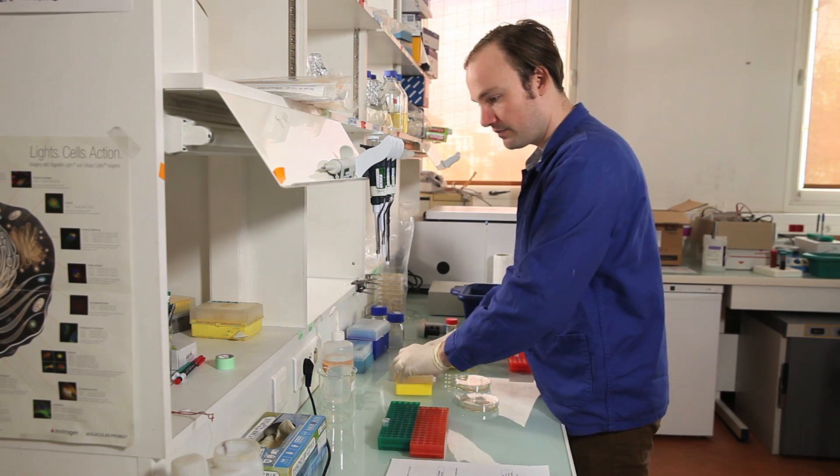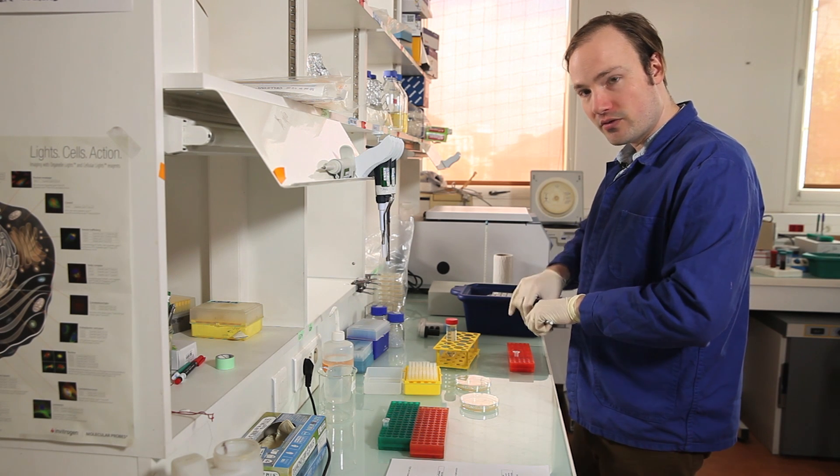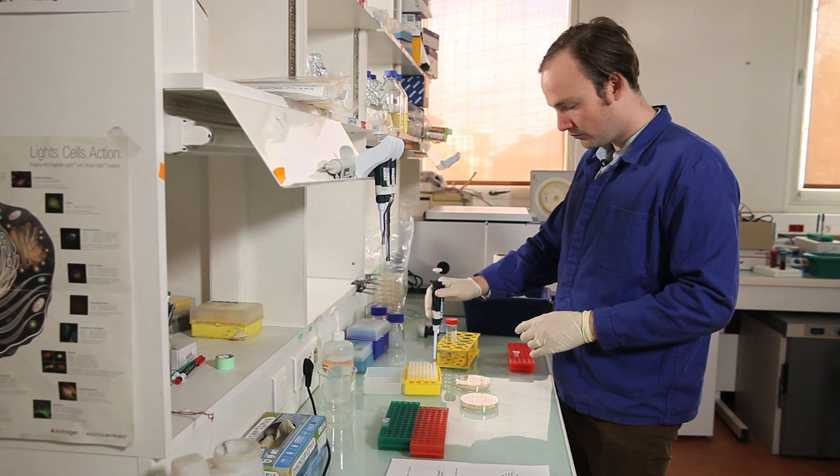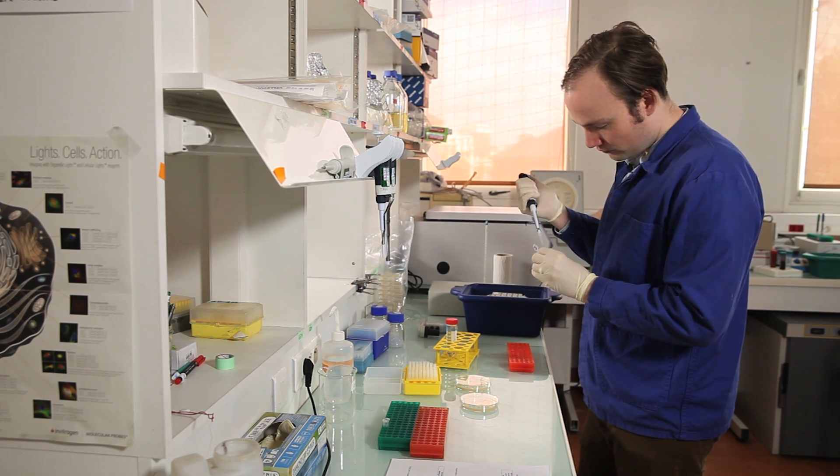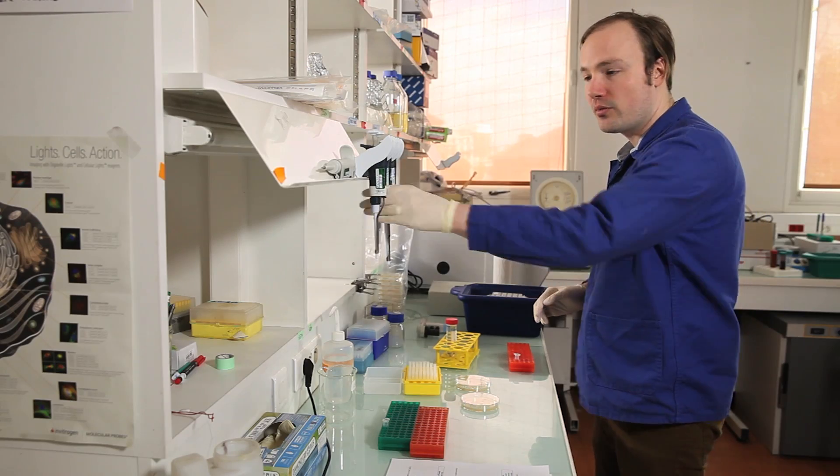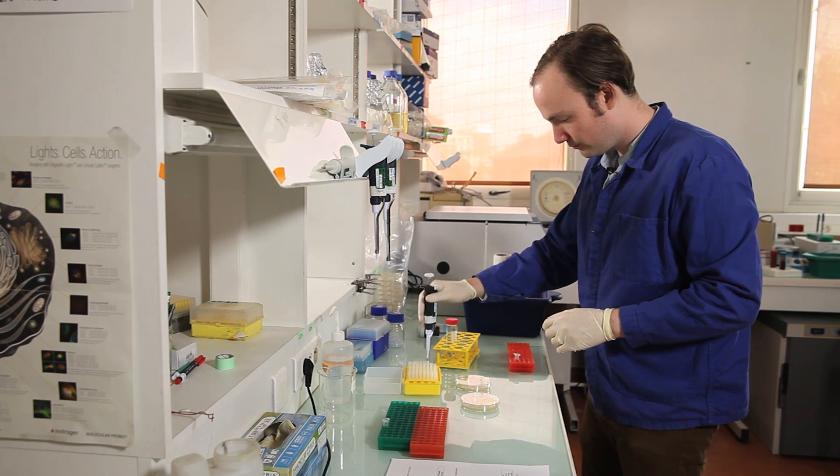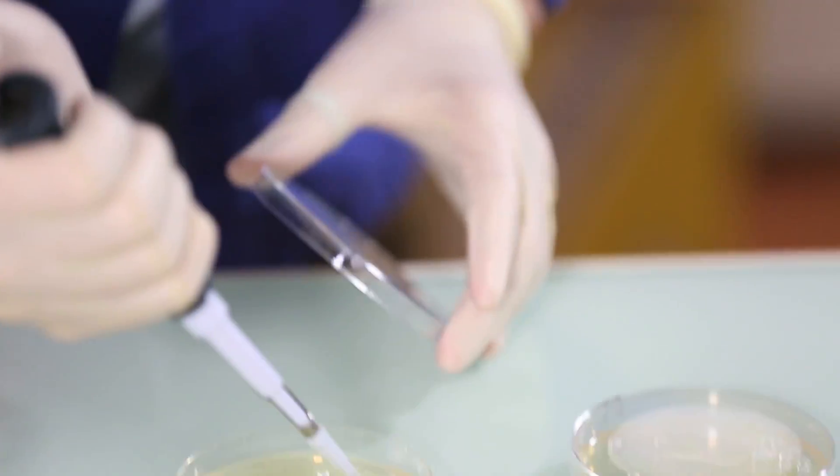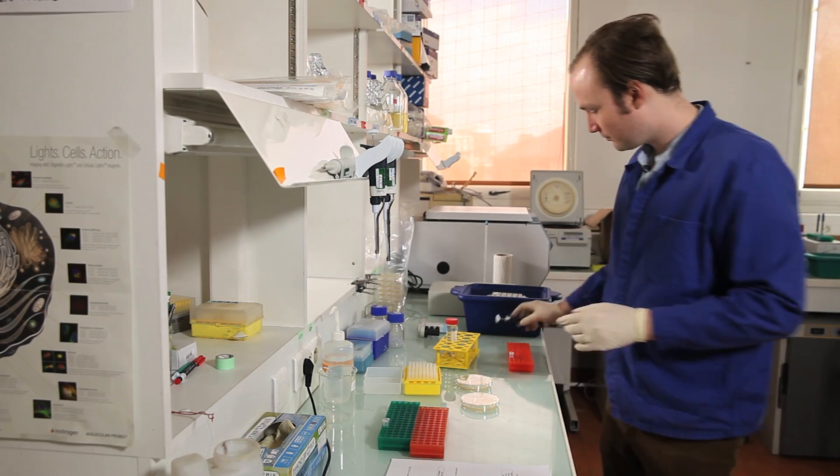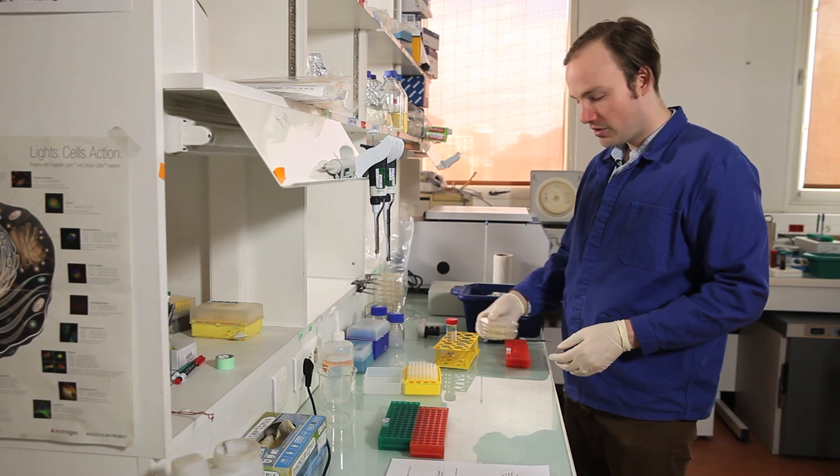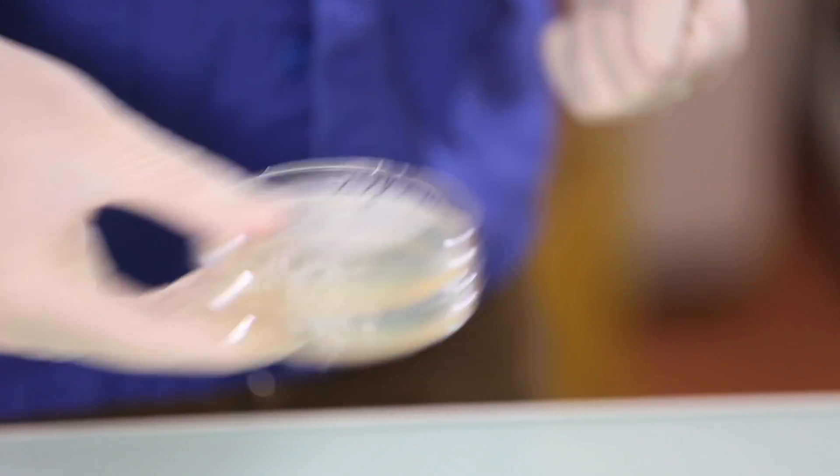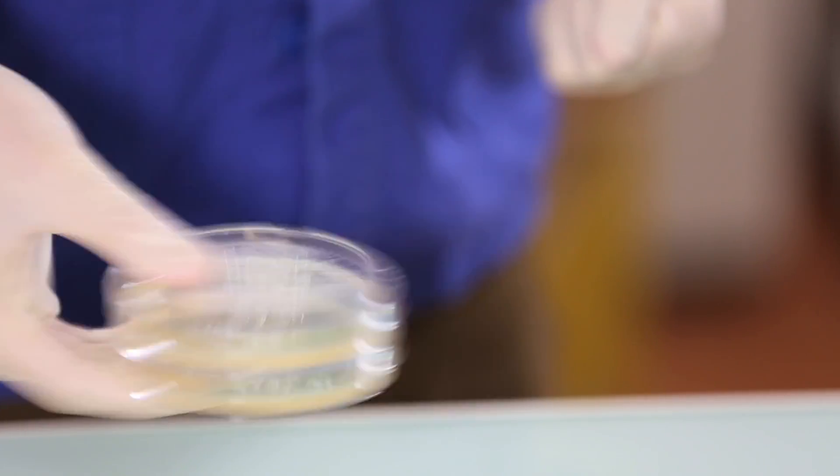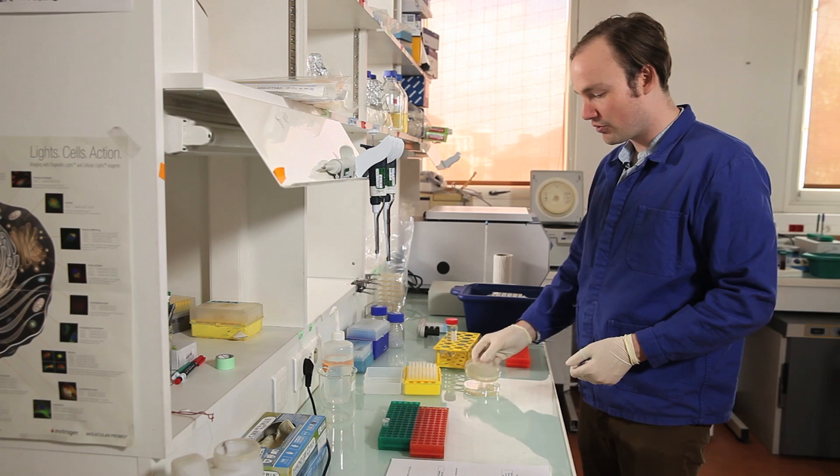Okay, so plate number one gets 200 microliters. And plate number two gets 20 microliters. Shake them, turn, turn, turn. Okay. And that's going to give us a beautifully even distribution of bacteria on our plates. Toss the beads.